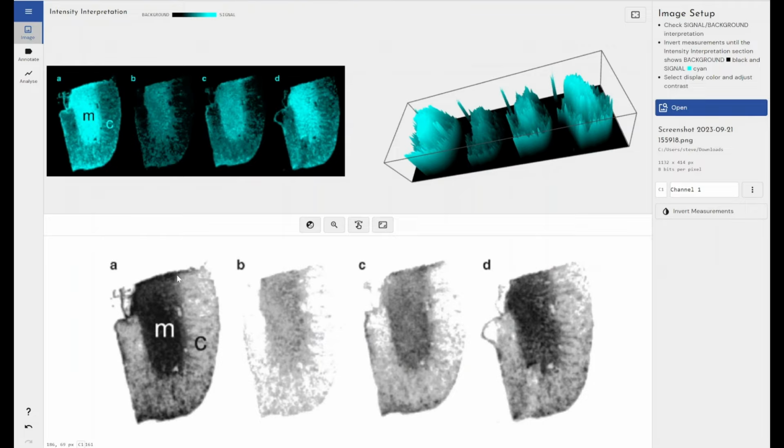So what I want to be able to do is actually take the values from B away from all of my other images as a background measurement to get the true value of the different intensity levels of my staining, and as an extension of that, which of my samples have I seen greater binding in? Do I have a greater receptor number for my particular ligand? And if I add an antagonist to my sample, what kind of intensity of antagonism can I get for the receptor for my radioligand? All these kinds of questions we can answer by performing image analysis within Phoretix Toolbox.